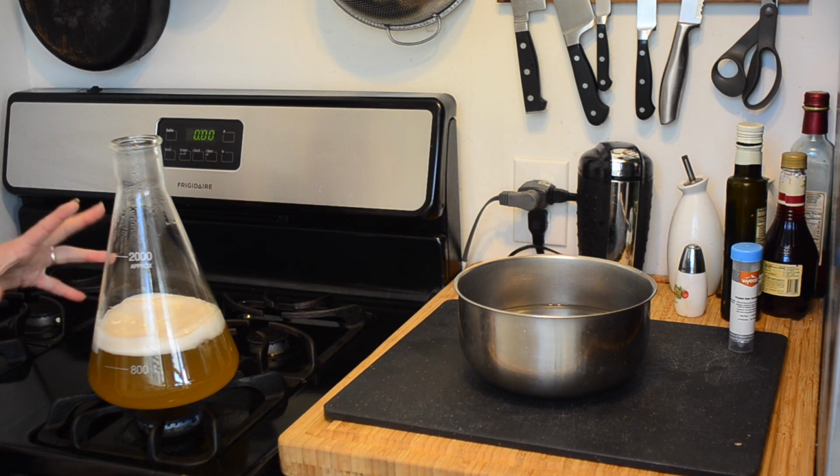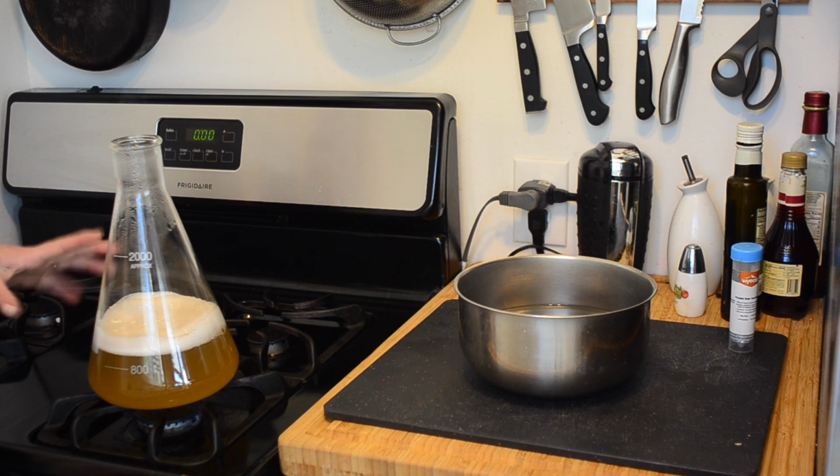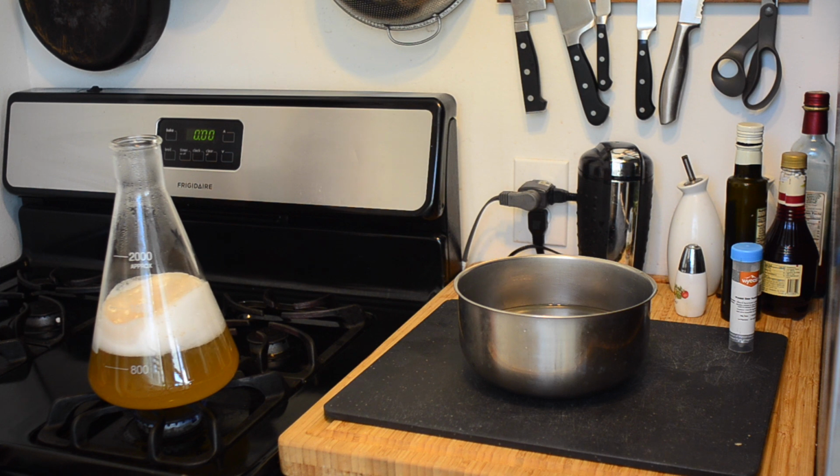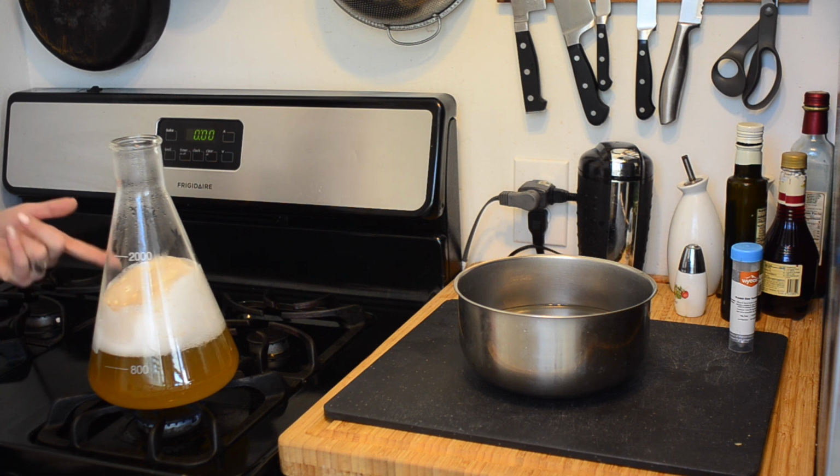So I bought this 2,000 milliliter flask because I used to be doing 800 milliliter starters in a 1,000 milliliter flask, and it was almost impossible to not boil over. This is the first starter I've actually done in this one. So it looks like it's going to be okay, but you've still got to monitor it a lot. I'm just waiting for this to break and hoping it will. It kind of looks like it's going to right now.